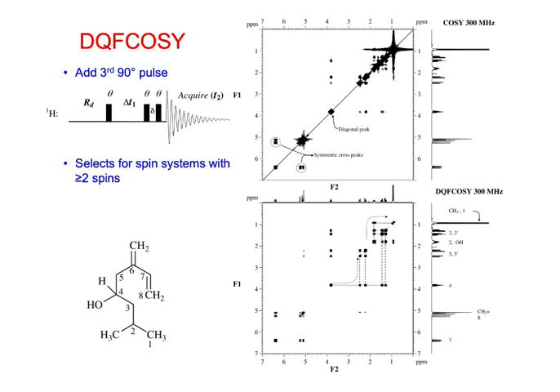All right, so the double quantum filtered COSY, so let me write that in, double quantum filtered. And I'm not really good at all of it, I was trying to read it. You've got to get in pretty deep to really understand all of what the double quantum filtering and things like this do.